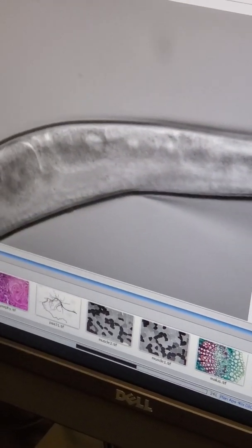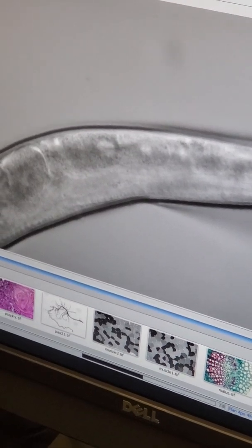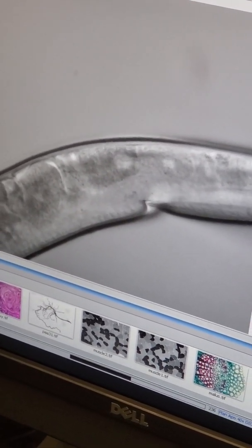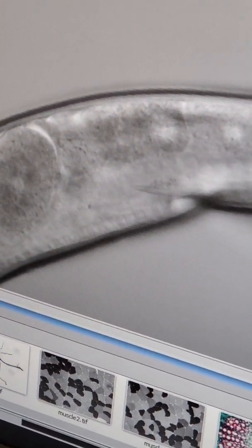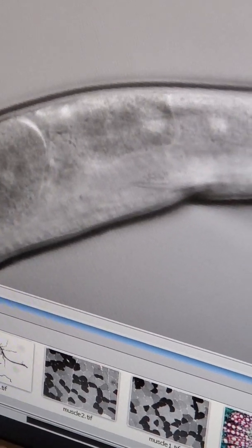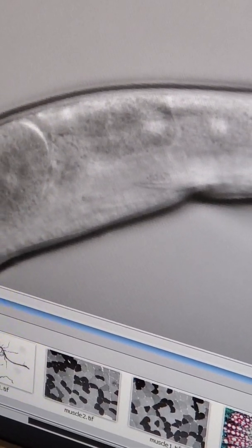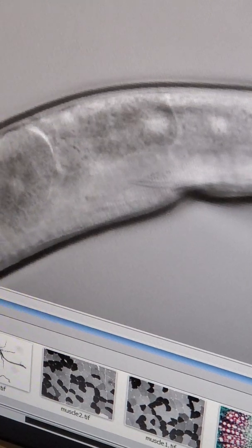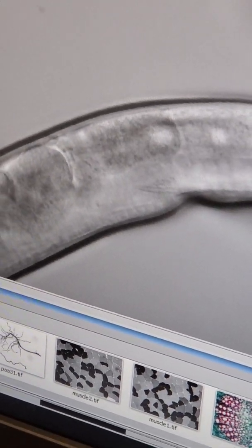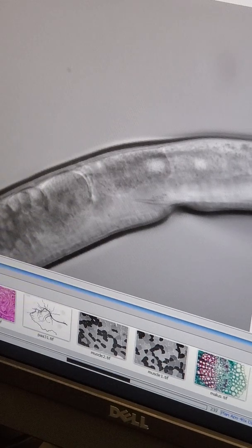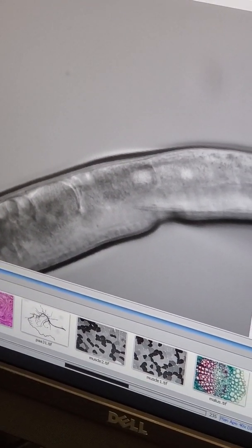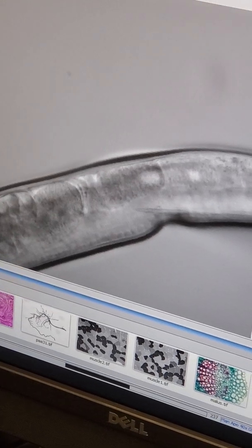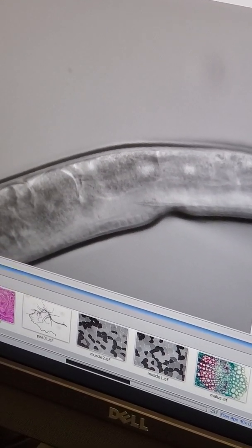So the needle is already at the same level as the worm. And we have the gonads at the right focus. And he's now entering the worm with the needle. And he's in. So I don't know if it will come up, if it will be visible for you guys or through the camera. But sometimes you can actually see the liquid go into the gonad and travel through. And that's a good indicator that you had a good microinjection.